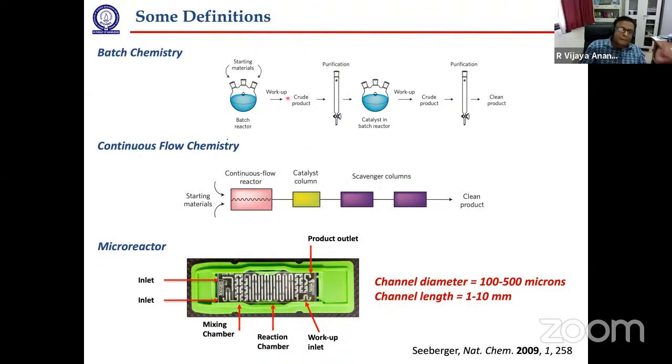Okay, in a typical experiment in our lab, what we do is take the reaction flask, you can see here, and then we add the starting materials, reagents or reactants in this flask, and then we add solvents, and then you have to stir the solution properly. There are two ways you can do that. We can fix the external stirrer unit here to stir the solution properly, or we can just put a magnetic bead inside the reaction flask, and then we place this whole setup on a stirrer, and we can just stir it. So that takes care of the uniform mixing of the reactants.